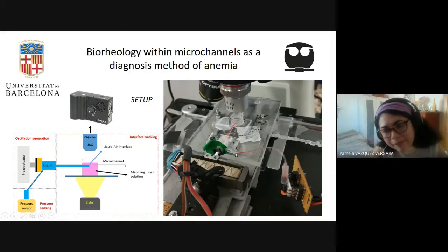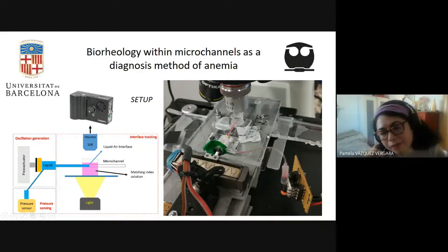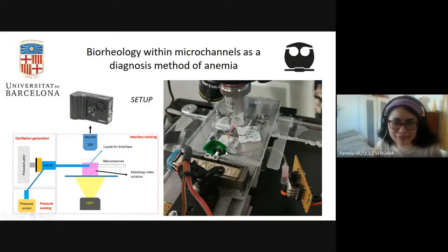On the side part, we have this small tubing that goes into a pressure sensor. If you see here, I put blood, it's all the red fluid, so all the system is filled with blood. The diameter of the microchannel is 500 microns, and the diameter of this small tubing is 125 microns. As in the case of Claudia, of the square microchannel, and the experiment that I just showed you, this resistance is going to dominate, and that will make the velocity not dependent on time. I will show you this in the next slide. I hope it's a little bit clear.